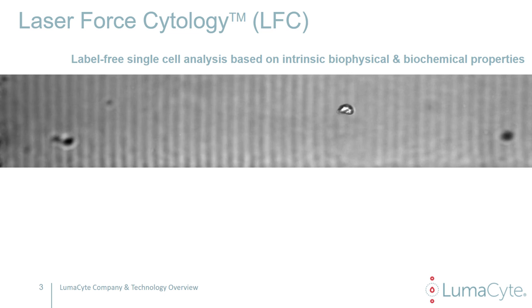And so what you're looking at in this video are vero cells infected with the Zika virus traveling through the microfluidic channel in the Radiance instrument. They're being driven in the system by fluidic flow from right to left, and they encounter an optical force from a laser beam on the left-hand side of the channel. As the cells move through the channel, they experience this optical force.